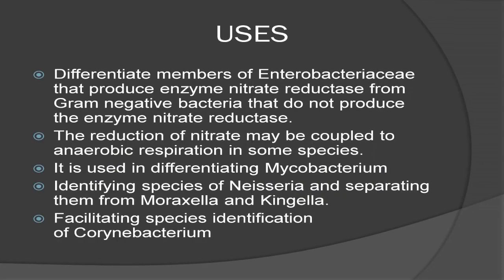The uses of this test are: all members of the Enterobacteriaceae family reduce nitrate, but some members further metabolize nitrite to other compounds. It is thus used to differentiate members of the Enterobacteriaceae that produce the enzyme nitrate reductase from gram-negative bacteria that do not produce the enzyme nitrate reductase.